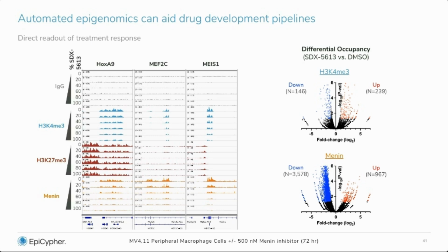And so what we did here is we mixed cells either treated with this inhibitor or the vehicle control at discrete quintile ratios. So these samples either had 20, 40, 60, 80, or 100% treated compared to controls, because we really wanted to see, you know, does this assay show good sensitivity and good linearity when you're inhibiting the target.